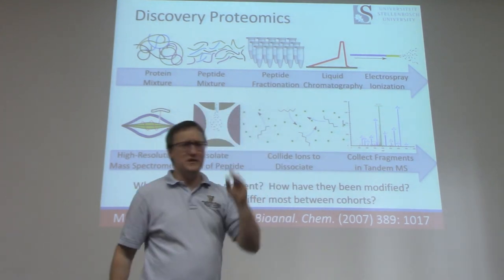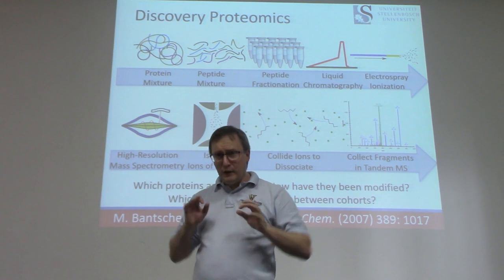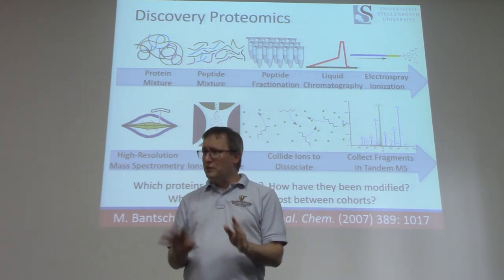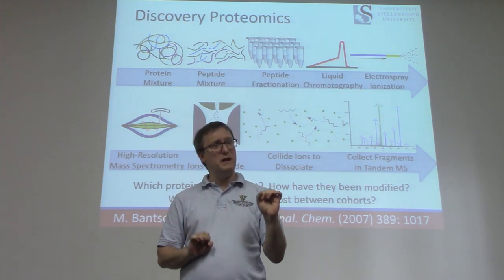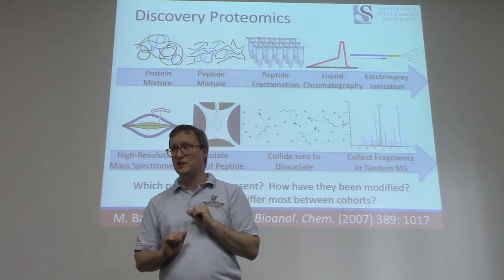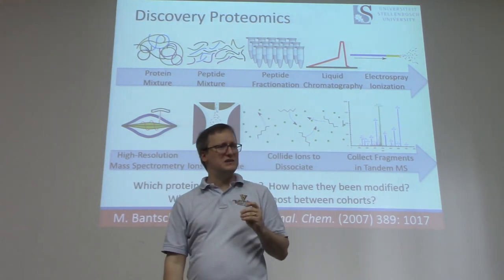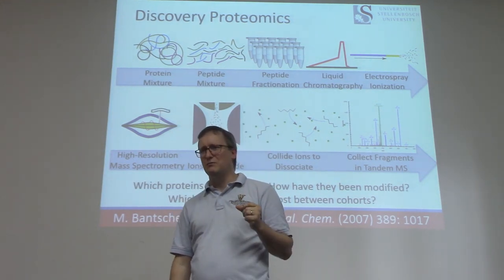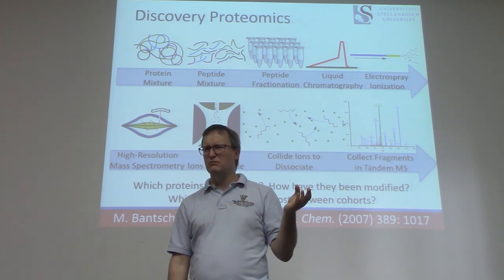So sometimes telling it by a cartoon is a little simpler, so I'm going to try that. Frequently, the kinds of questions that bring someone to a proteomics facility are based around proteins, or maybe the modifications of those proteins. So they come to us with a protein mixture, and one of the very first things we do is get rid of the proteins by digesting them into peptides, typically with the enzyme trypsin. Does everyone know trypsin? Great, okay.